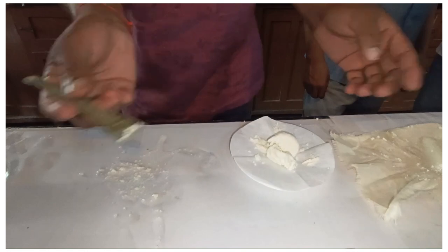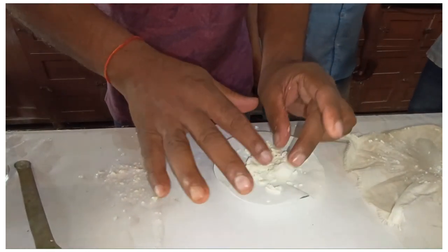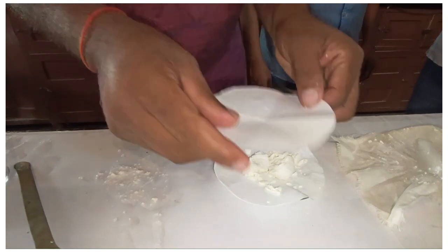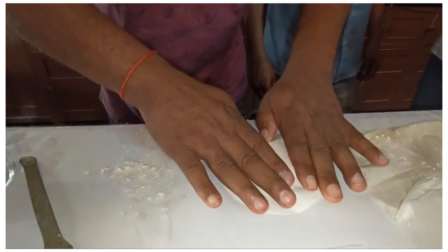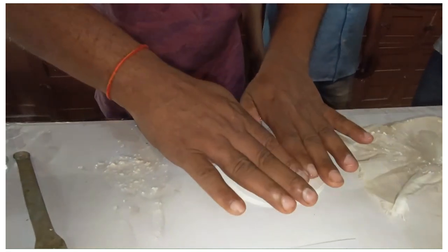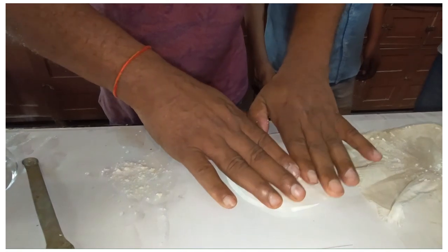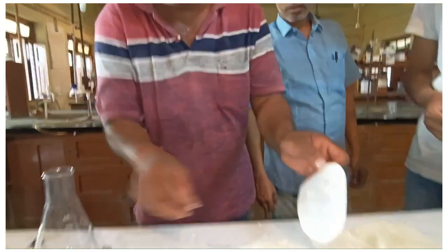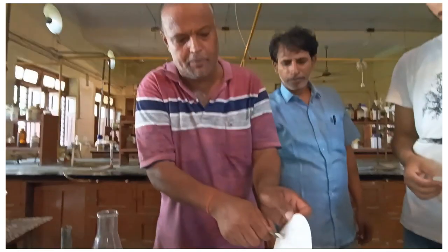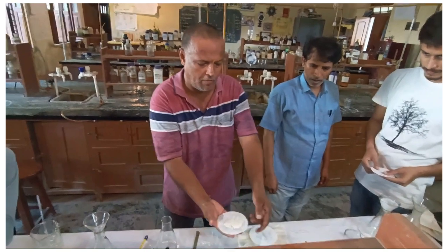I hope this experiment is good, and after this we will make it dry and see the amount. After drying, we will wait. How much will there be? This is all about the experiment, and we have to weigh the protein or casein what we have collected from the 100 ml of milk. You just see the beauty of the experiment.